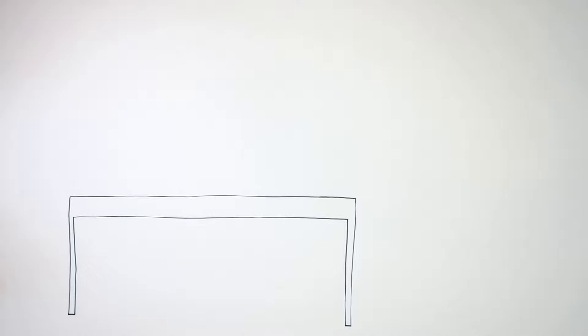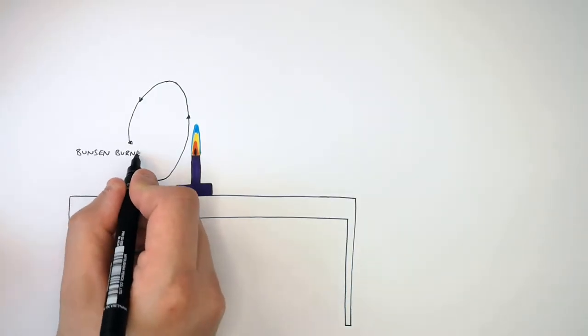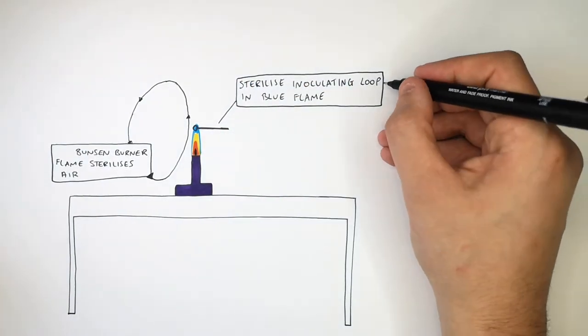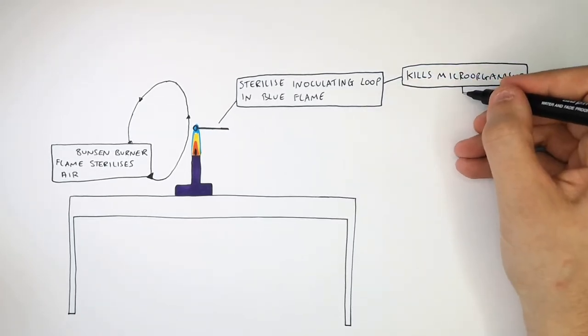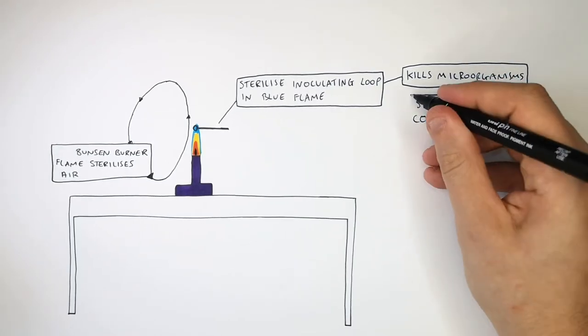Now you've sterilized your bench, place a Bunsen burner on your bench and turn it to a blue flame. The blue flame will sterilize the air around the Bunsen burner by convection. You then sterilize your inoculating loop in the flame, which kills any microorganisms on it. Remember to sterilize the inoculating loop in a blue flame to kill microorganisms and prevent contamination.